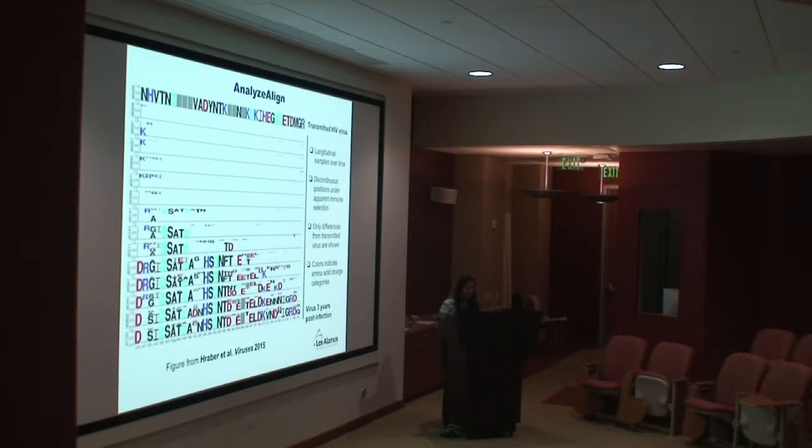So that's also interesting, and I failed to mention this, but in analyze align and quick align, that shows up as a big pink O, but for this paper, it's not pink. So you can see that analyze align can be used especially in longitudinal studies and when you're following certain epitopes. And so that's a good tool for that. And I think with that, yes?